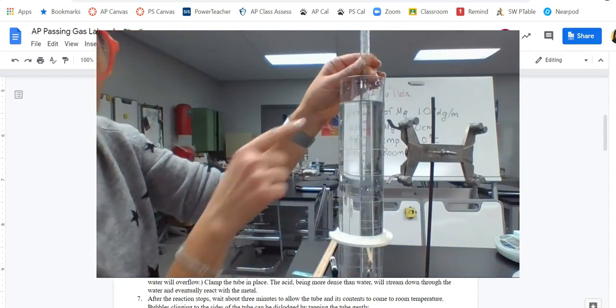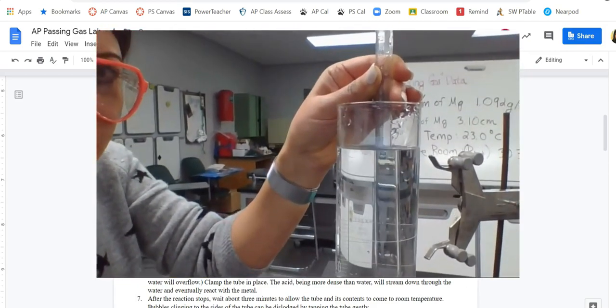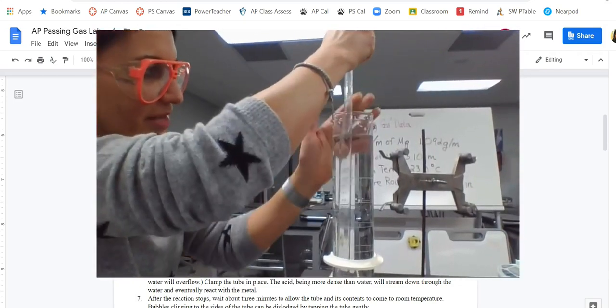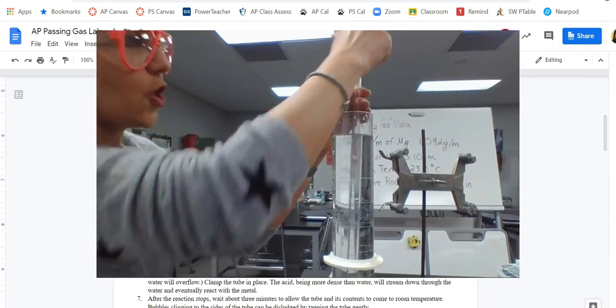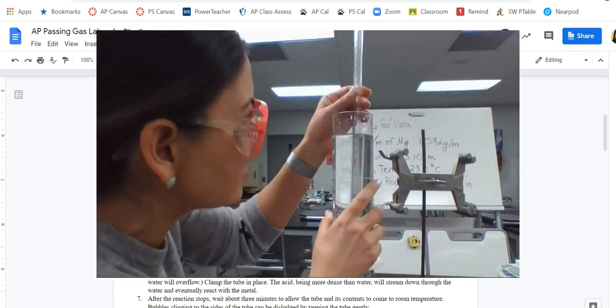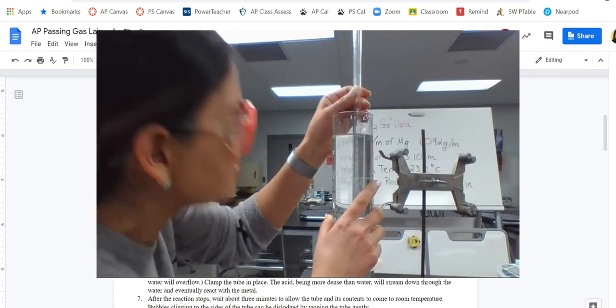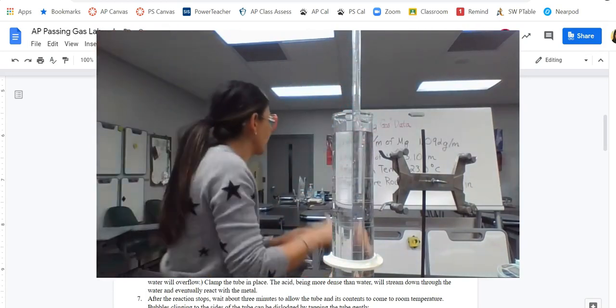So it is going down. I don't know if you can see where the 32 is. Sorry, no, not really. I would need to put some white paper behind there. Okay, but the 32, then it goes down to 33, down to 34. So let's write down that this is our last piece of data that we needed, by the way, 32.60 is what we're going with, okay? And then I can just dump this out, so let's write that down.